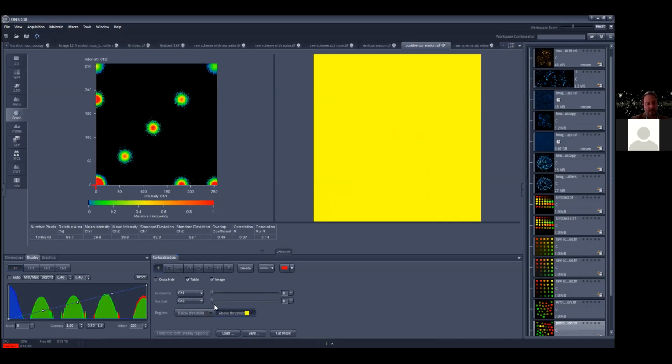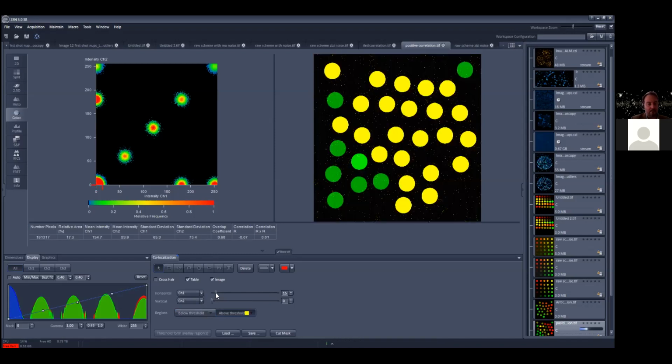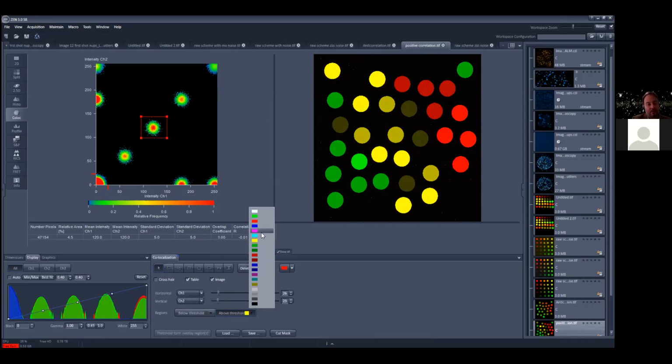Yeah. And then, oh wait, maybe we can put just to remove the background. You can see here the little red dot, which gives you the threshold. But we can also click inside the histogram here on the left side. I think yellow is not a very fortunate color here. Yeah? But we can also ask the question, hey, these pixels that belong to this population, where are they on the image? And you can see here, those are those. Yeah? If I go down here, those are the other ones.